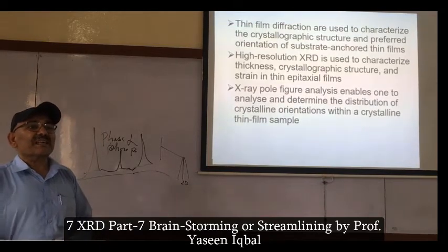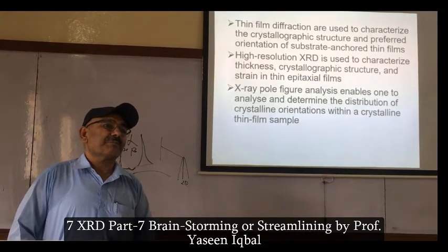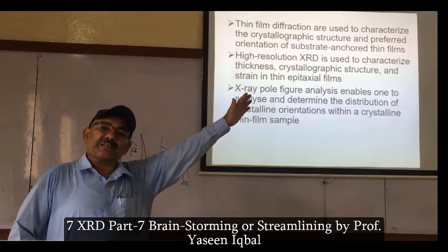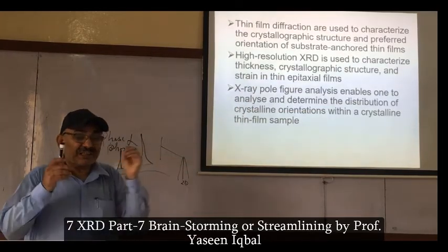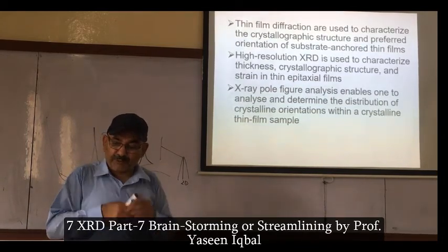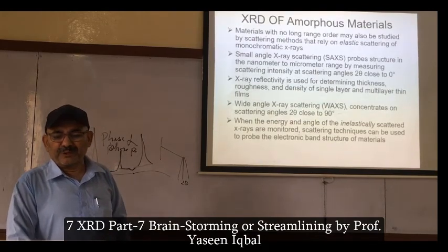So X-ray is not an imaging machine, where people put XRD on their paper or in their presentation and say, I have done XRD of my sample. XRD tells you a lot of science. So think about these things, how we are using XRD, how it can be used.